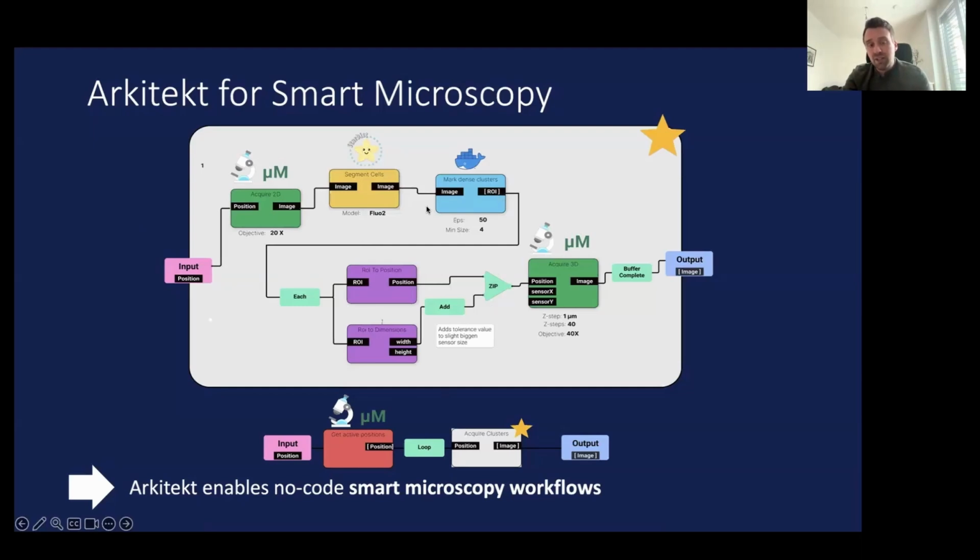And yeah, if there's anything that I would like to survive from Arkitekt, even though Arkitekt is surviving, it is this approach that the microscope does one thing well, let it stay with that task. Don't try to put deep learning in the microscope software or into Napari. I feel there's a place for all of these things.